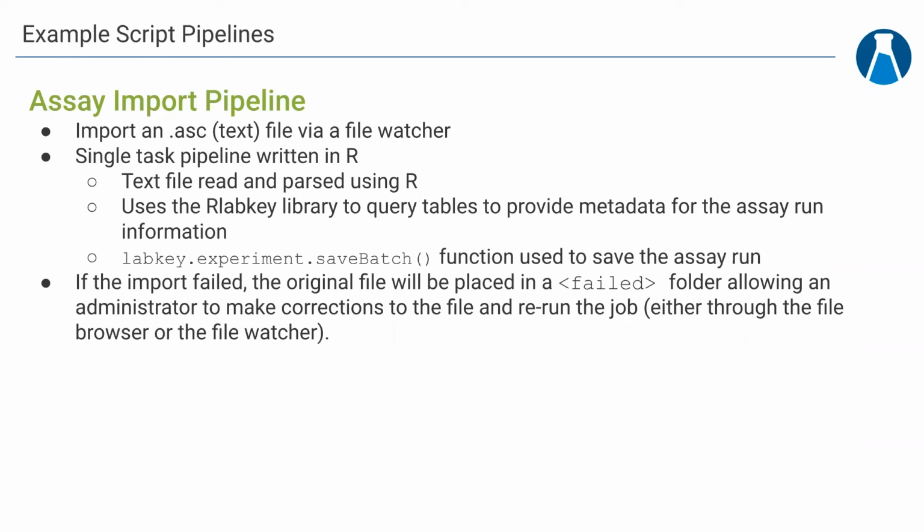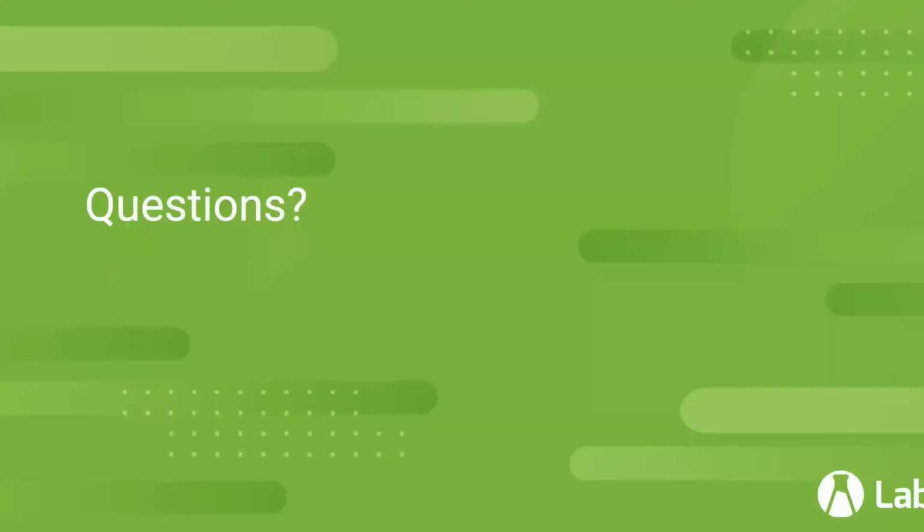And then this one, if it fails, it puts it into a different folder, which then allows the user to come in and apply some corrections as necessary.